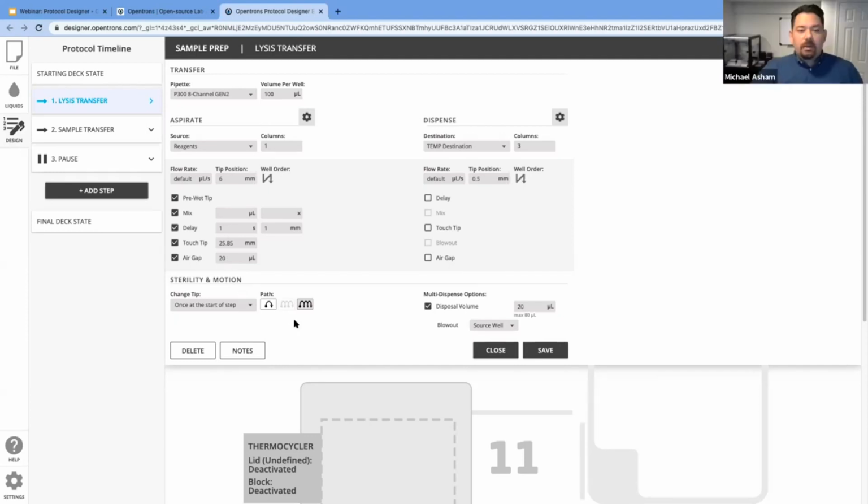All right. Can you ask the OT-2 to aspirate from a column that has some wells that do not contain liquid? And how would you change the Z heights on that labware choice? Yeah, absolutely. So if the wells do not contain liquid, you can absolutely have the system still aspirate from them.